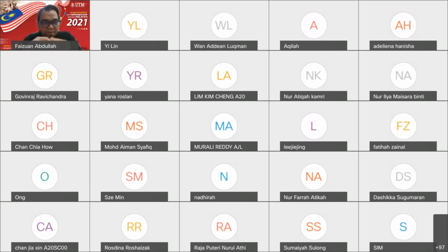From 10 ppm of stock solution, how much you need to take to prepare 0.1 ppm of zinc solution in 100 ml volumetric flask? Okay, and give me a figure for that.